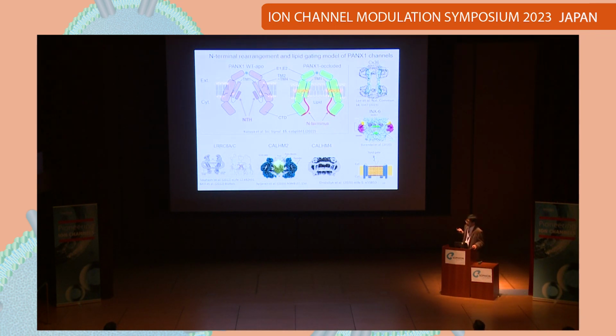At present, our interpretation is that there are phospholipids in the pore and they may be able to migrate by lateral movement. However, I have to say, this interpretation is still speculative. Interestingly, other groups have reported similar structures, for example LRRC8, connexin channels, and connexin 36. Cryo-EM structures show pore density, some of them show a double layer, and a lipid gating mechanism has been proposed. Totally the same as our interpretation.